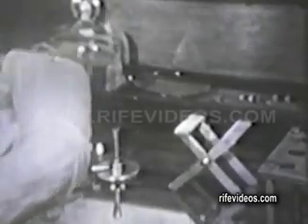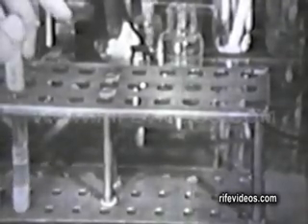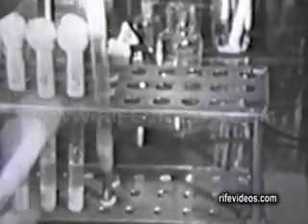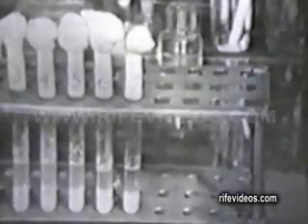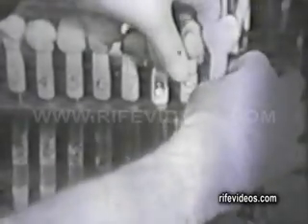The test tubes were placed in a 2-inch water vacuum and irradiated for 24 hours as they progressed up the test tube holder. Everything is flamed to sterilize the bacteria, the cotton that held it, and the solutions. Every time one test tube disappears, it means that there's an elapsed time of 24 hours between the radiation of the lights.